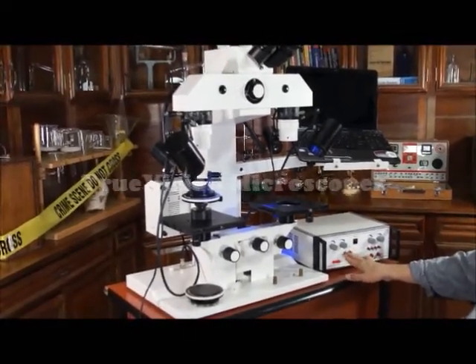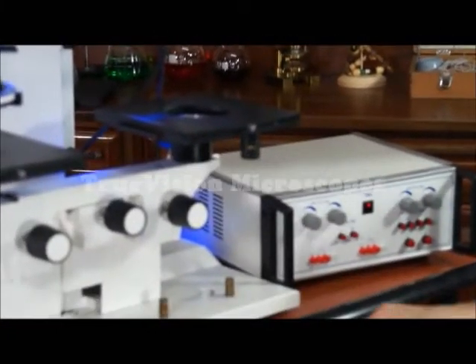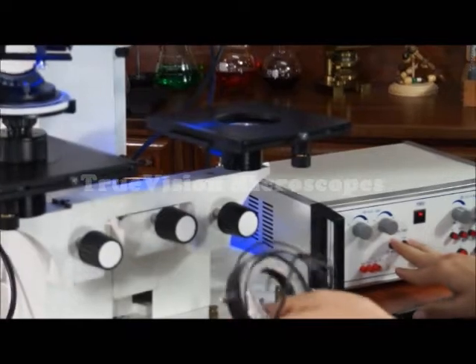These knobs are for the ring lights to turn on and off the ring lights.